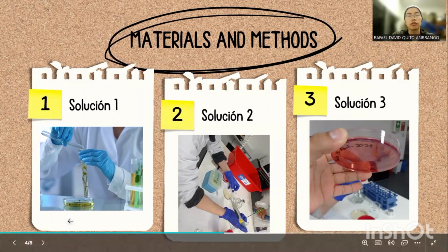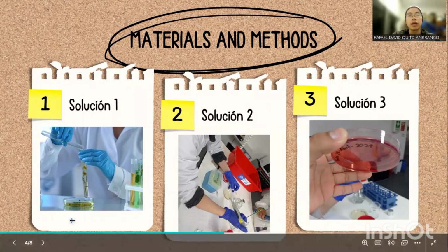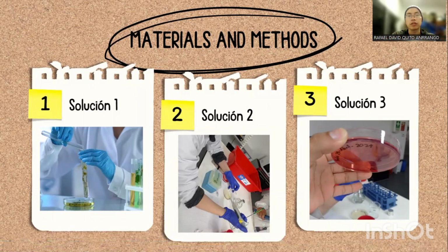First, sow 1 milliliter of the rinsing material. In case you have confluence during reading, use a smaller dilution. You can dilute it to 10 to the power of minus 1 or so, directly by the extension method. 2. Incubation. Place the plates inverted in the incubator. Incubate at 35 degrees Celsius for 48 hours.